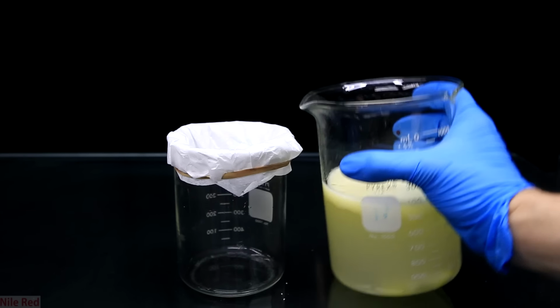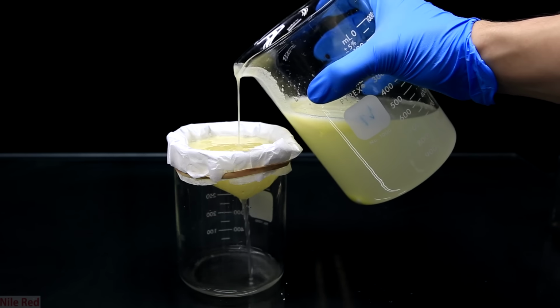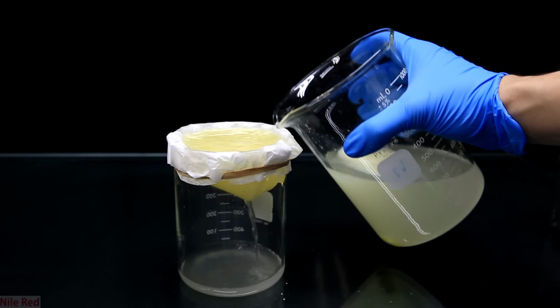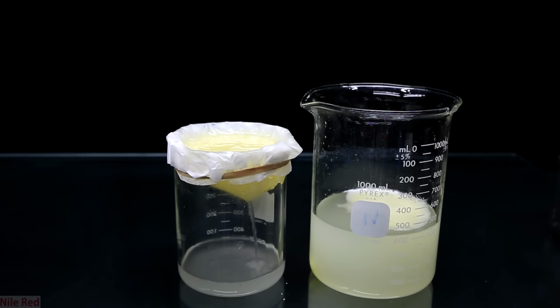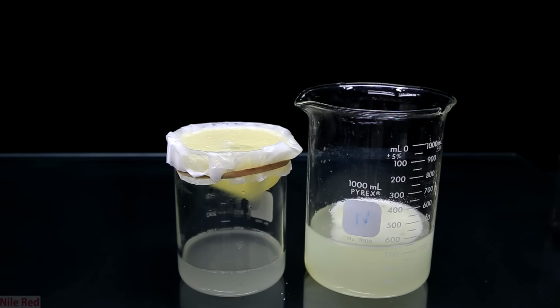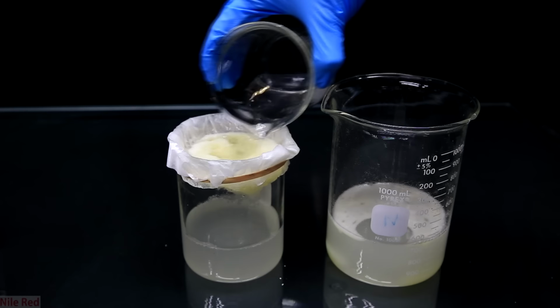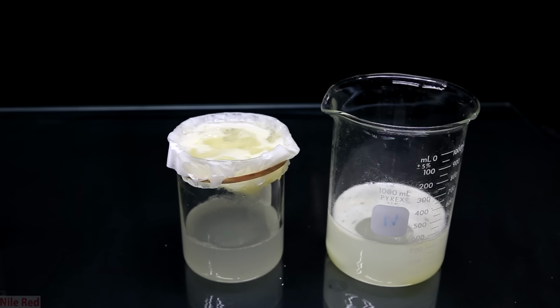The next step is to filter off this polymer that's just floating around, and to do this we use coffee filters. Because we're working with a strong basic solution, I would recommend using 2 coffee filters because the base might destroy one and then everything could fall through. As it filters through, you should notice that the solution we're getting is colorless. Once pretty much all of the top layer of the polymer has been removed and most of the water is filtered through, I added a little bit of water to wash it.